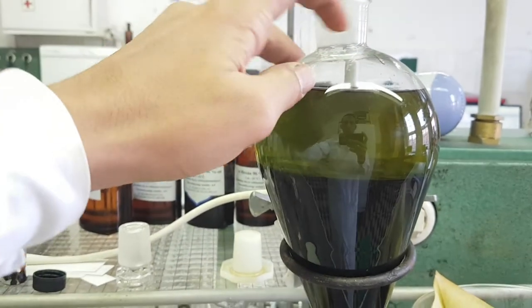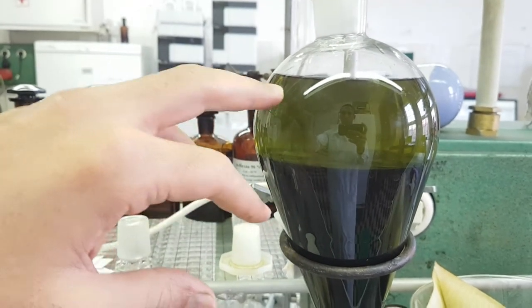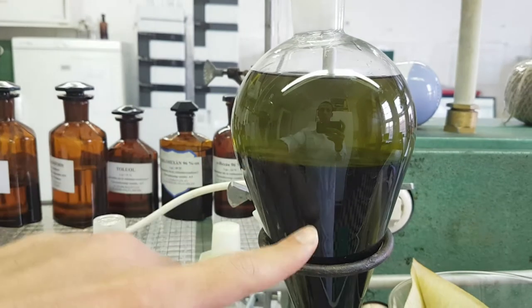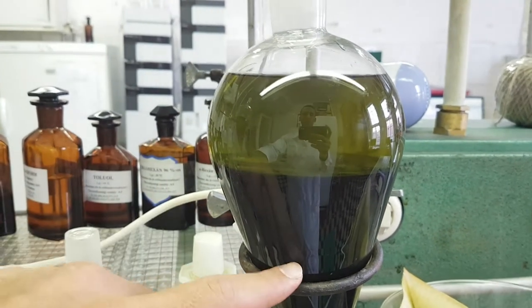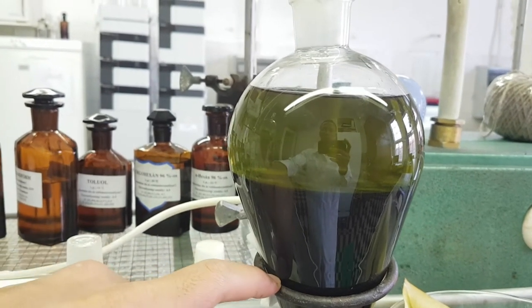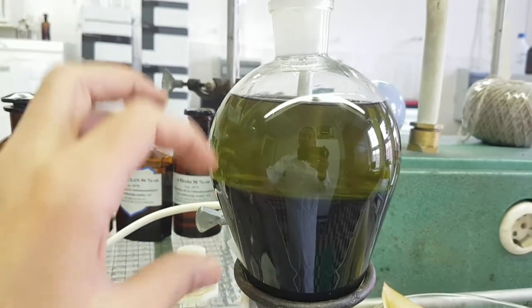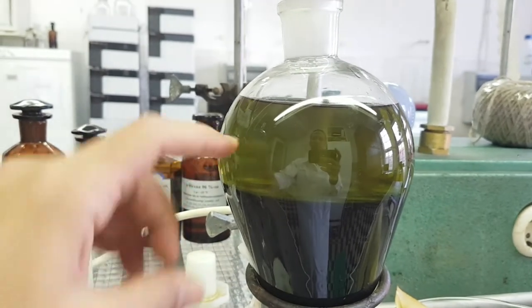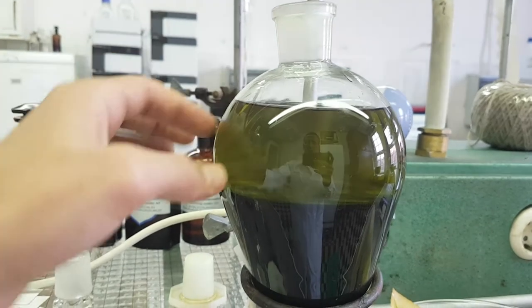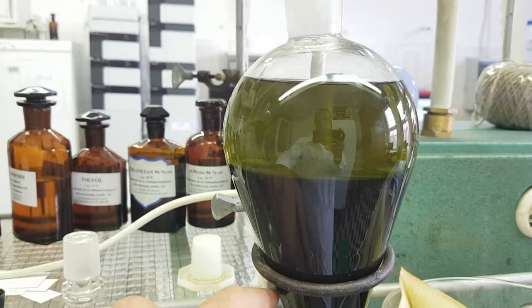While operating with liquid extraction, you need to pay a lot of attention. For example, here I have two different phases and I can distinguish between them. But sometimes you might have two phases and not be able to distinguish between them. Here I am using hexane, which is a non-polar solvent, and I am trying to extract the hexane weak fraction from the aqueous layer.